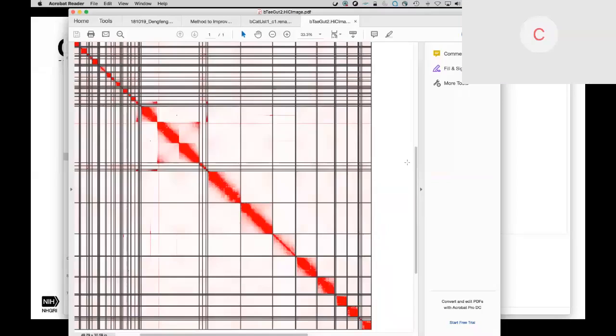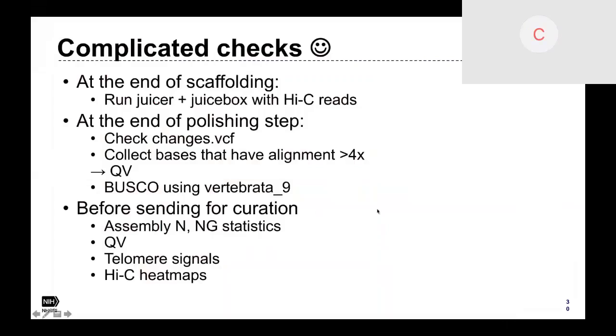I think in the near future we're going to have the ability to see this before the end, because we're going to add some steps to the SALSA, those kinds of things. So if we spot this kind of error, what should we do in general? Should we ping Christine to take a look, or what should be the course of action?